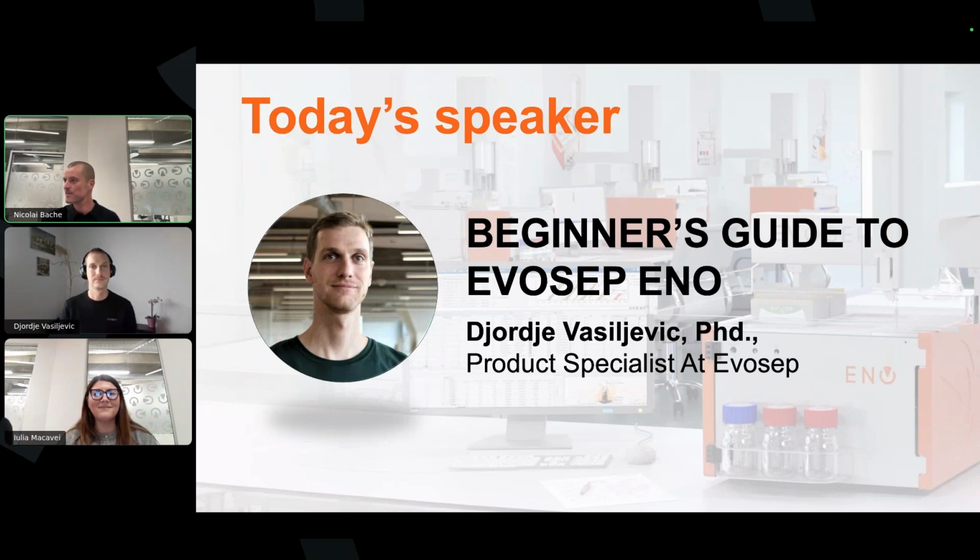So there's a question. I'm not entirely sure. It's basically asking, is there a basic tutorial for that? Well, we have tutorials. We also have a how-to-load-your-Evotips tutorial. If that's what you're referring to, then yes. We also have other tutorials, as Djordje mentioned during his presentation. If not, then please feel free to re-ask that question.